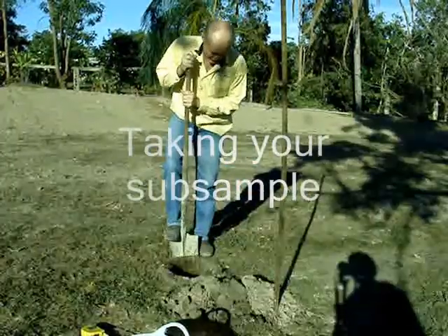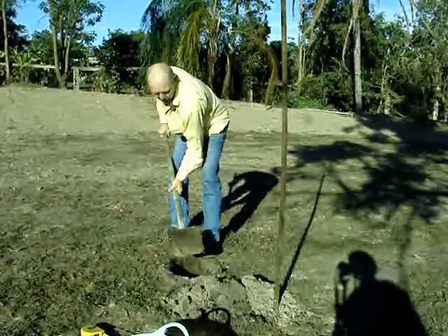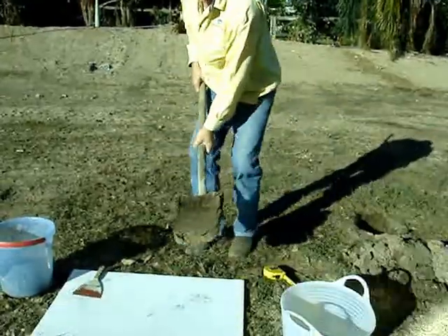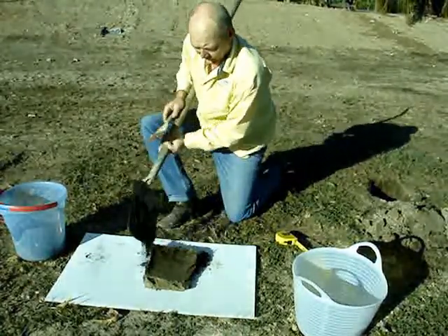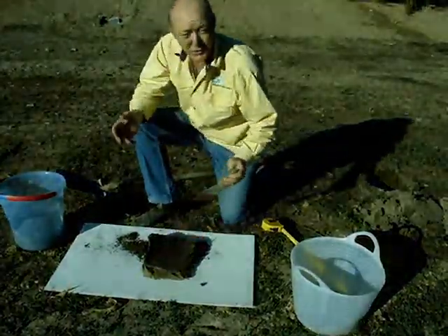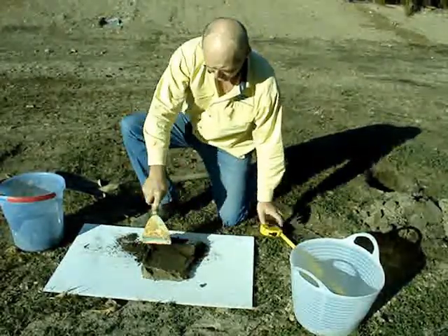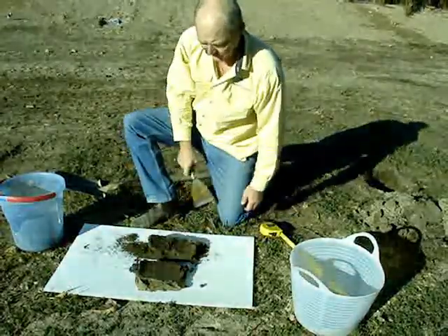The easiest way to do this coring is to use a shovel and take a slice down the outside of the hole — you'll end up with a nice neat slice. Here's the topsoil and the rest is subsoil. We take this slice, scrape it off the shovel, and find that we've got a fairly distinct A horizon or topsoil and a B horizon subsoil. We're actually going to separate those two out.